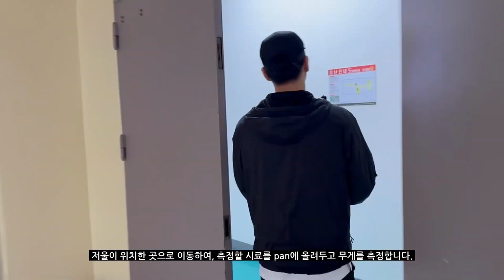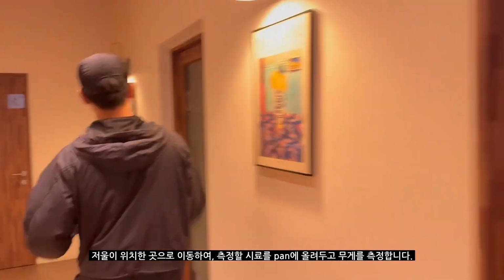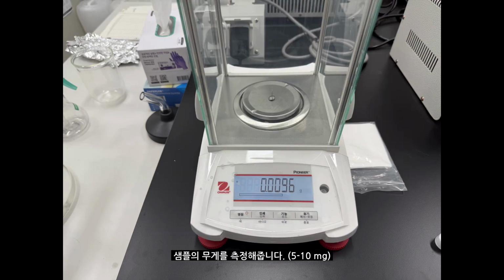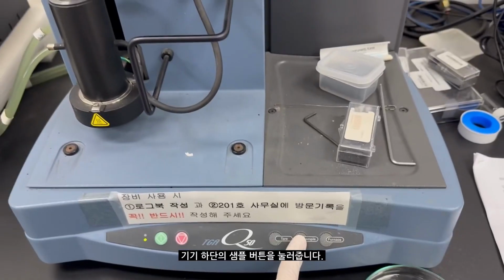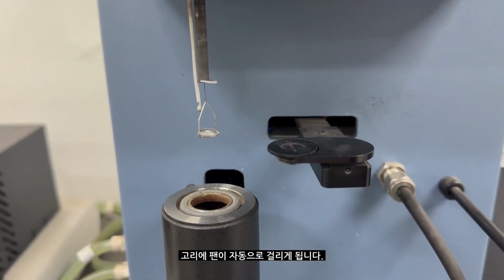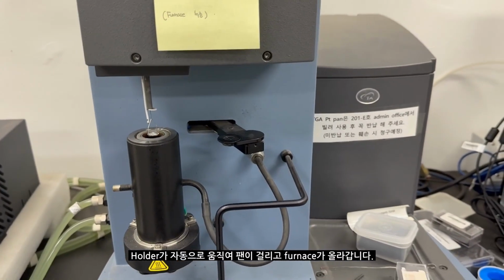Head to the location where scale is located and measure the weight of sample. Tare the pan. Measure the weight of the sample. Place the pan on the TGA device. Press Sample button. Pan is suspended automatically. Holder moves automatically, and the furnace ascends.